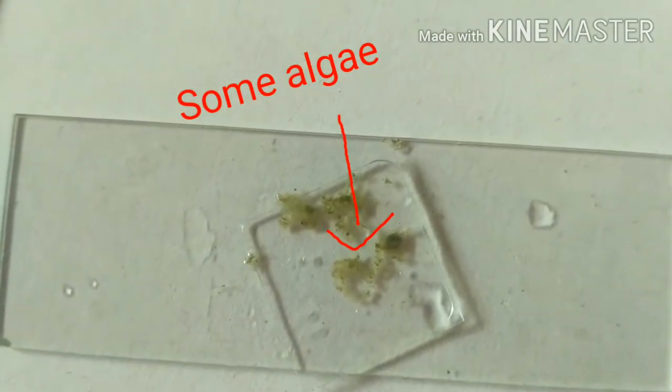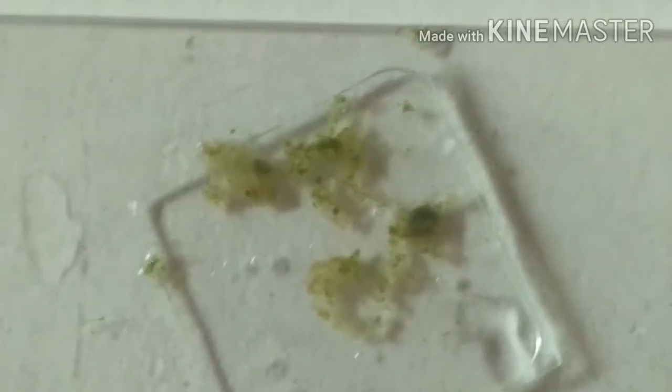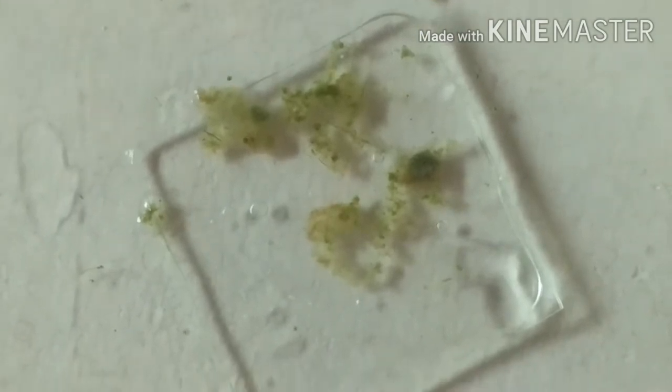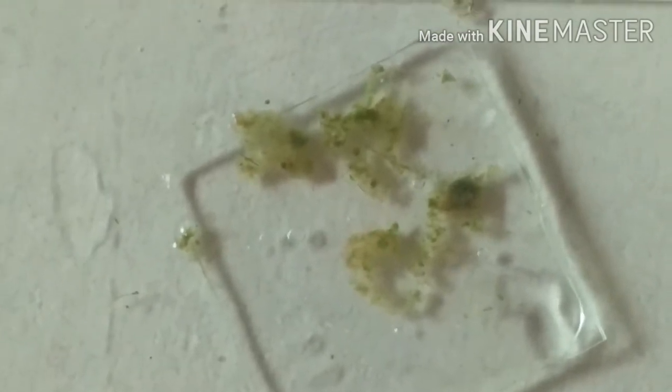I've got some algae which I picked up from the bucket, which I left for a few days along with some water. So let me show you how this looks like down the microscope.